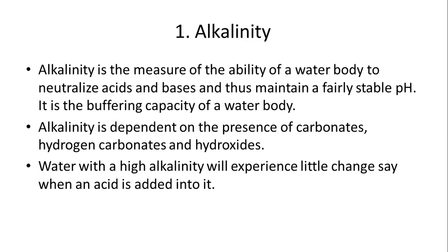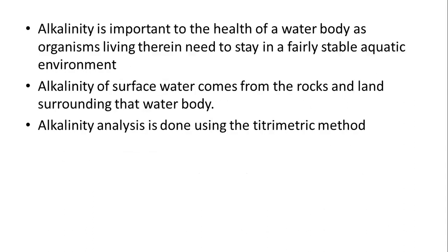Alkalinity is dependent on the presence of carbonates, hydrogen carbonates, and hydroxides. Water with a high alkalinity will experience little change when, say, an acid is added into it. Next slide. Alkalinity is important to the health of the water body. Organisms living therein need to stay in a fairly stable aquatic environment. If you introduce a shock to a water body, say you add acids into the water, obviously the organisms within will suffer because you are disrupting their usual way of life. Whatever conditions they're used to surviving in, you are altering that.